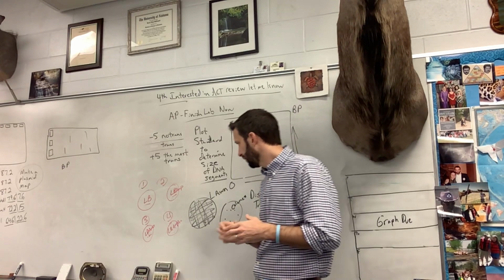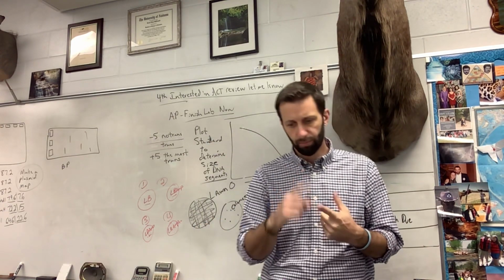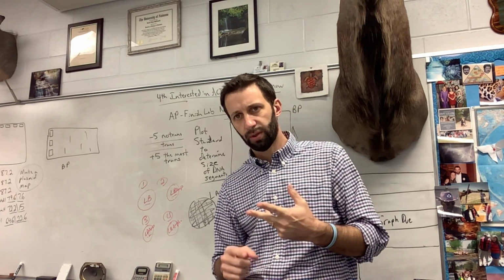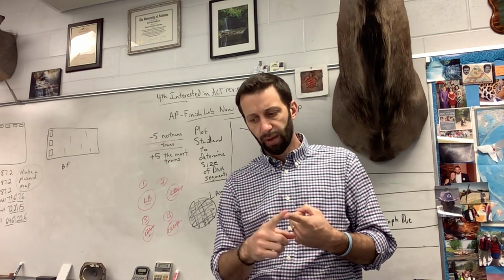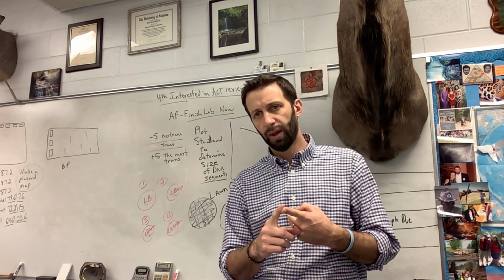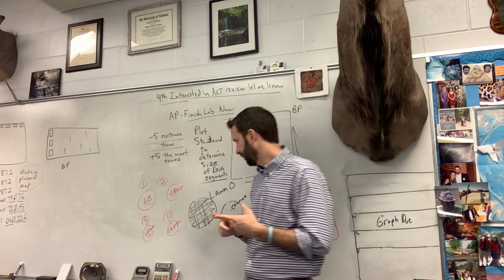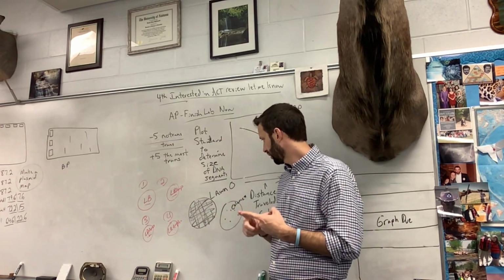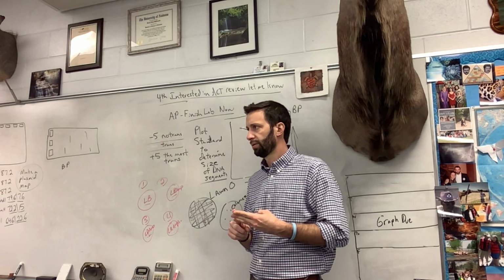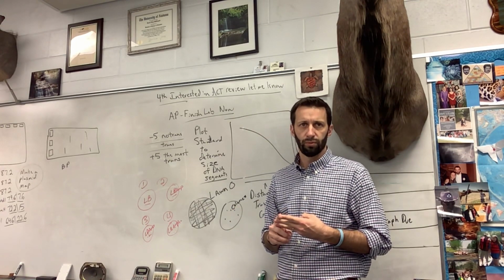Okay, we'll see. Number 4, we've got LB amp and we've got positive. So you've got broth, you've got ampicillin, the antibiotic. You've also got positive. Positive means, what did you have in there? You had the Pglo plasmid mixed in with the bacteria. So what do you expect to happen in that one? Lawn, colony, nothing? No growth? What do you expect to happen?